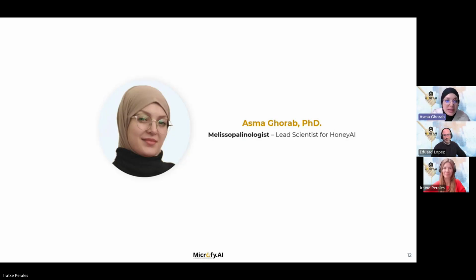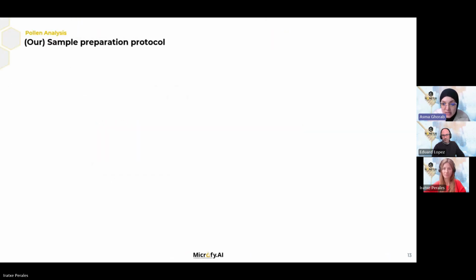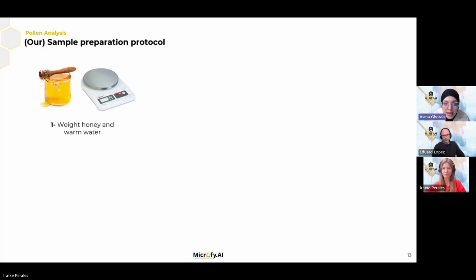Okay. So my name is Asma, as Erachi already introduced me. I'm the person responsible for the Melissopalynology section and the creation of the pollen dataset. So I'll briefly explain how the sample is prepared. It's very simple to collect. It requires only basic materials. Anyone can do it. It's not necessary to be an expert. You just have to follow the steps.